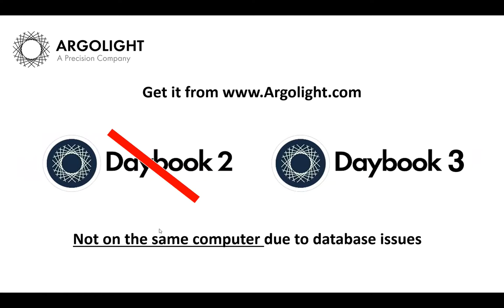The second thing is that we do not advise to have Daybook 2 and Daybook 3 on the same computer. It can create database conflicts. So if you want to test both software, please install these on two different computers or two different sessions on the same computer.